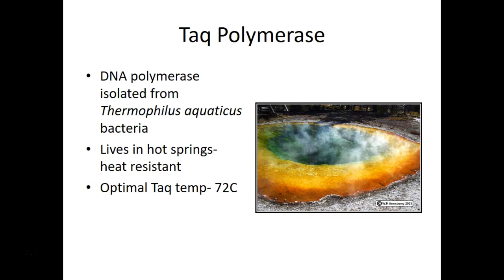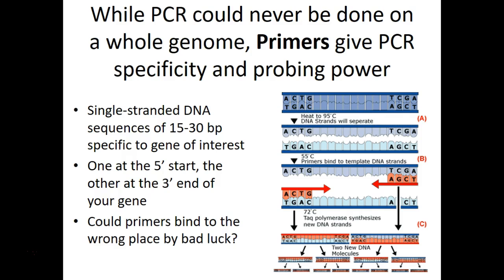That is a heat-tolerant bacteria that you can find in Yellowstone's hot springs, and so on. Prismatic Spring. We get another primer that matches the very end of our sequence, and the same enzyme can copy in that direction, and in that way we only copy the target sequence. We start here, we end here, and we have zillions and zillions of molecules of DNA.